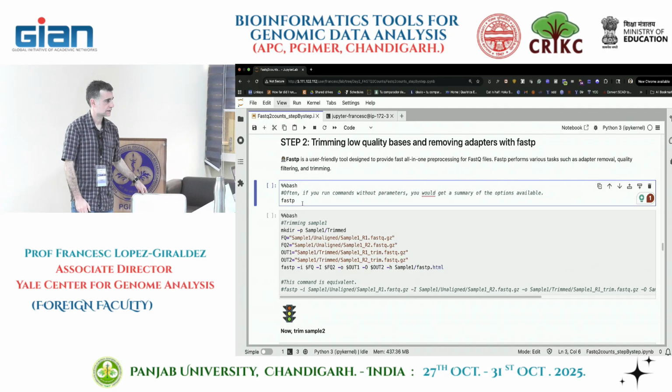You are talking about the reading of 150 bases. So how many bases there are depends upon the number of cycles. It's a cycle of image that you are taking. You can say it like that. One cycle is taking one. It's the same. One base is one cycle. So the reason that read 2 drops in quality is because it gets sequenced later, so the machine is already wearing down.